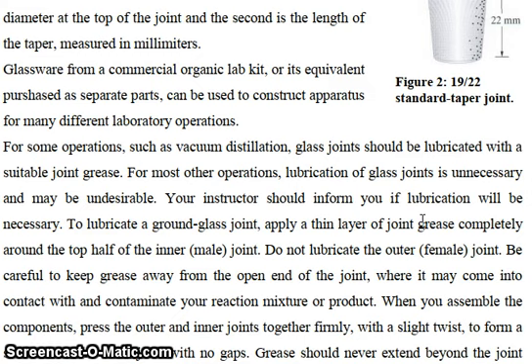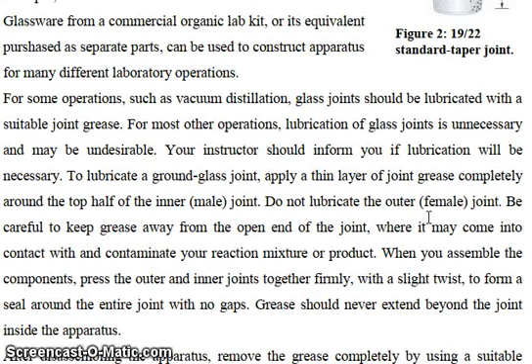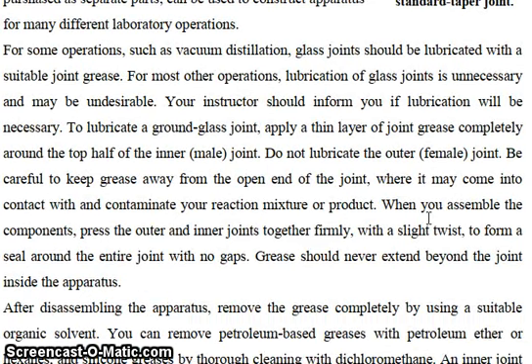To lubricate a ground glass joint, apply a thin layer of joint grease completely around the top half of the inner joint. Do not lubricate the outer joint. Be careful to keep grease away from the open end of the joint, where it may come into contact with and contaminate your reaction mixture or products. When you assemble the components, press the outer and inner joints together firmly with a slight twist to form a seal around the entire joint with no gaps. Grease should never extend beyond the joint inside the apparatus.